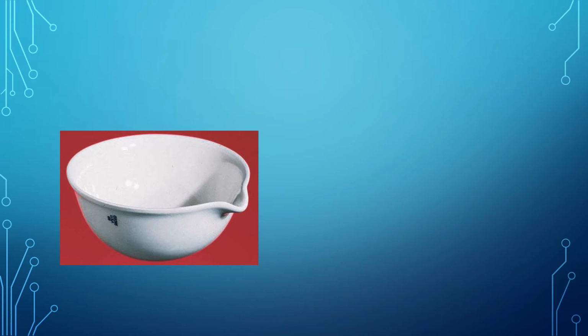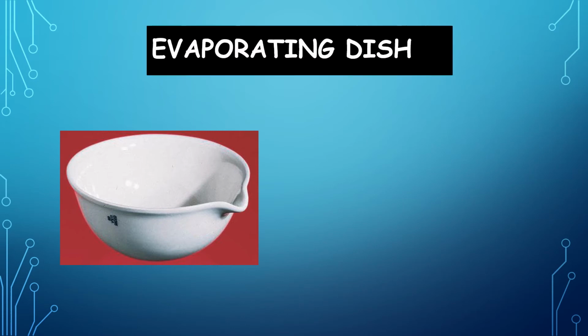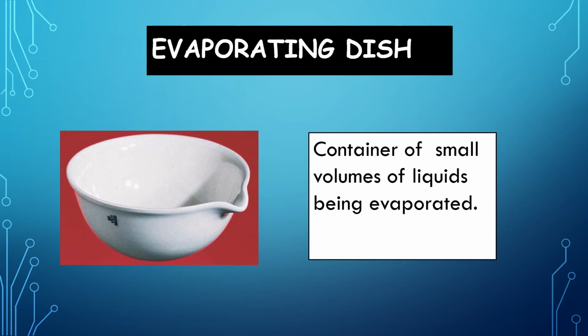Okay, so what is the name of this also? It is called evaporating dish. Evaporating dish. So what is the function? Container for small volumes of liquid being evaporated. So for example, the water. If you want to evaporate water, then you can use the evaporating dish.